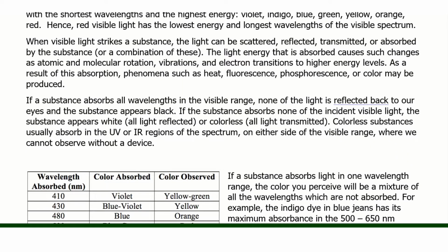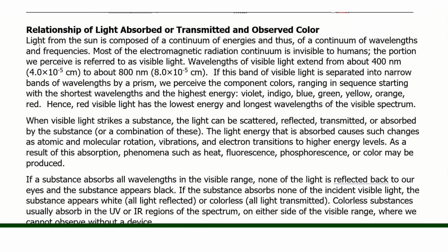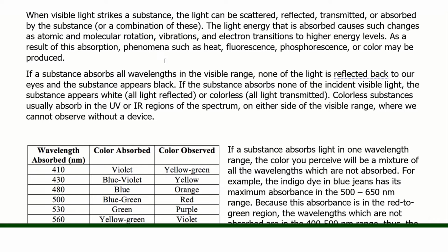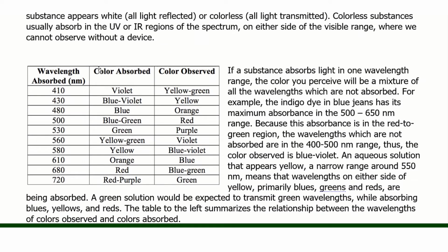So definitely read through this intro. This first paragraph is just a recap of what you've learned in lecture, the principles. And then we go into absorption versus color observed. Each color that humans can see with our eyes corresponds to a certain wavelength of absorption, and the color you will see will be the opposite.